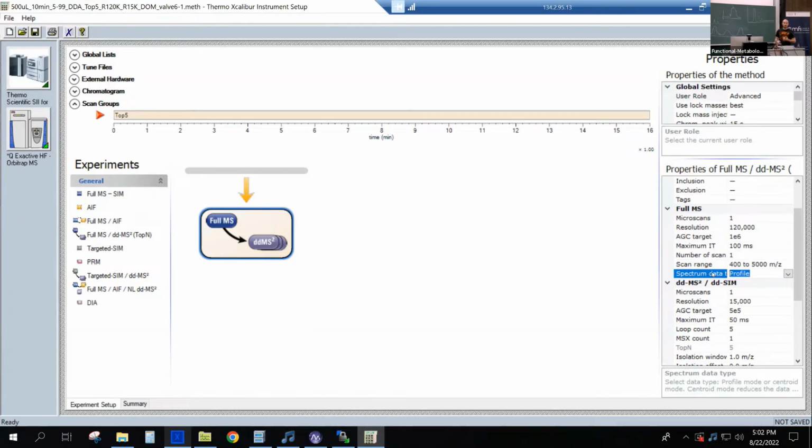But it also means that it's a lot of data, right? And we can simply remove all these data points and only look at that one data point at the top, and then draw this as a line. And then instead of, I don't know, 1,000 data points, we now have only 3 of this particular peak. And that is called centroid. And that is an important step we do in our data analysis tomorrow with MSConvert, or like Efi showed earlier with the raw file parser, right? So that she used for the centroiding.